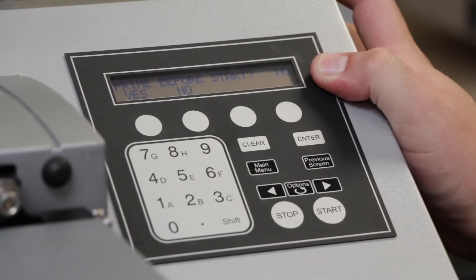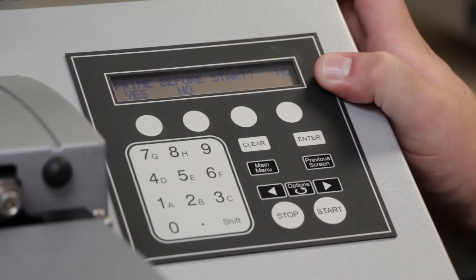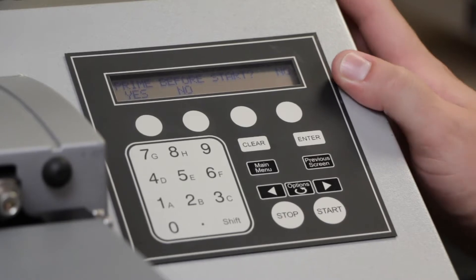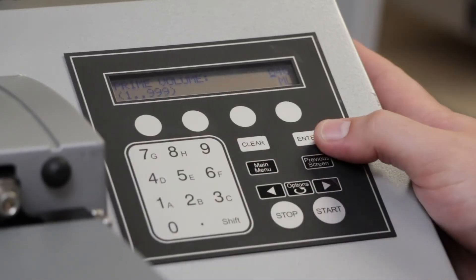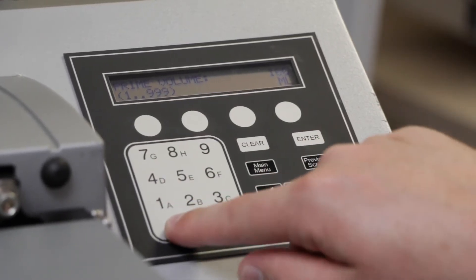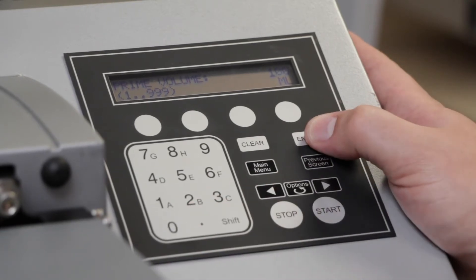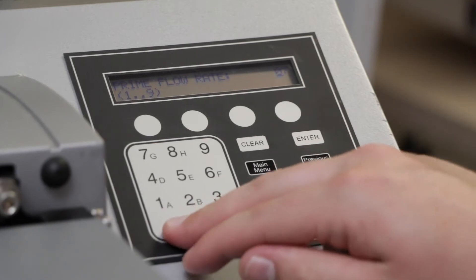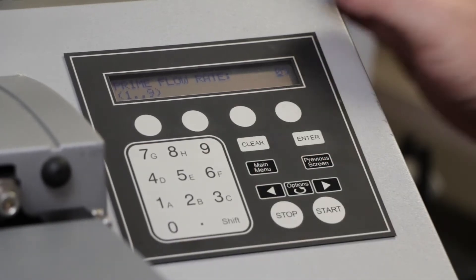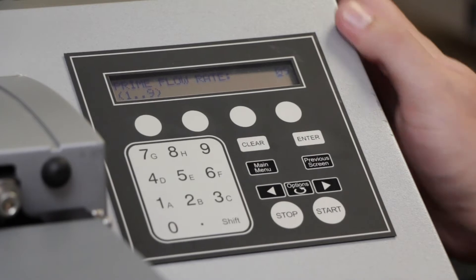Prime before start is a great way to make sure that your washer is primed and ready to go before running a wash protocol. We'll tell it to run 100 milliliters of water through the system before we wash. Our prime flow rate will actually turn up to 9, though admittedly these values don't matter too much as we'll be priming into the trough anyway.